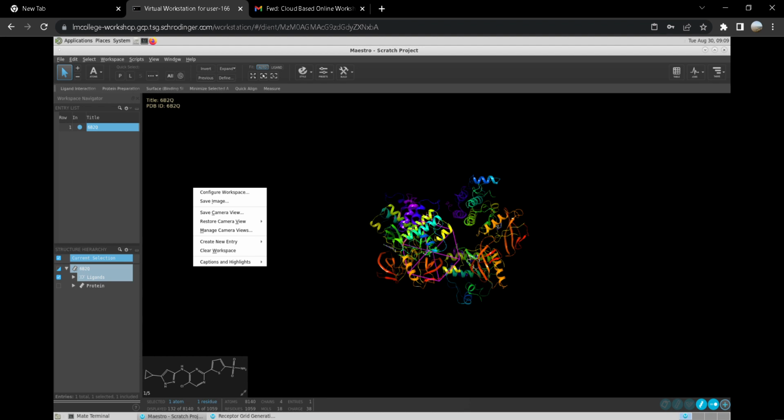For protein selection, there are various aspects which you need to look for: protein name, its organism, from where it is extracted. Then you can also look at its resolution and how many residues are present in it. Ideally, there should not be any missing residue. Then you can look at parameters like the inhibitor structure present inside the protein and how strong its biological activity is.